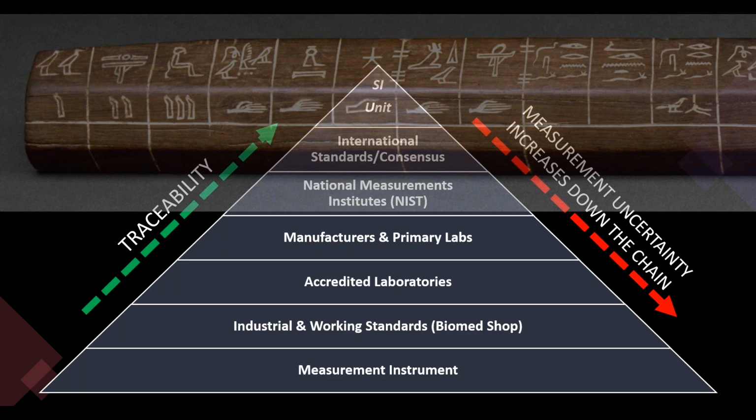And with the graphing meter here, we can actually show you what the response curve looks like as we either shake or stir the pot and move the probe around to look at your different thermal layers. As we get closer to the ice, you'll see the response curve start to drop down. That's the nice thing about your PRTs, because you have that average sensing. So you can see how it moves around and shifts.